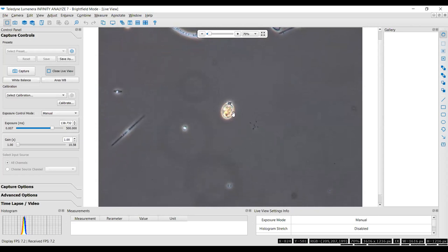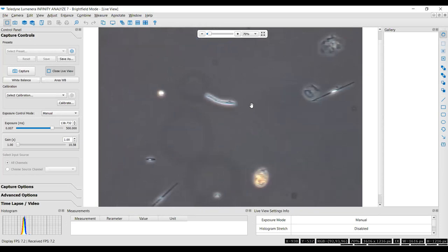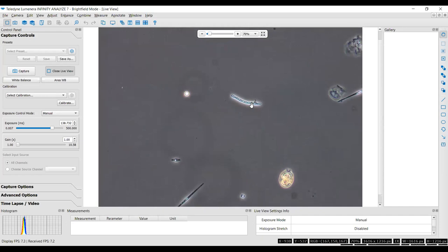So this is Trachelomonas. It's a euglenophyte and has a lorica, a little collar on this one. Often they have iron. They can bloom, though they don't often. If you see a lot of euglenophytes, that tells you, oh hey, I've got a lot of organic matter. Just good to know. And then here's a really nice Pseudanabaena, with nice cell constrictions for us. It doesn't always oblige us that way.